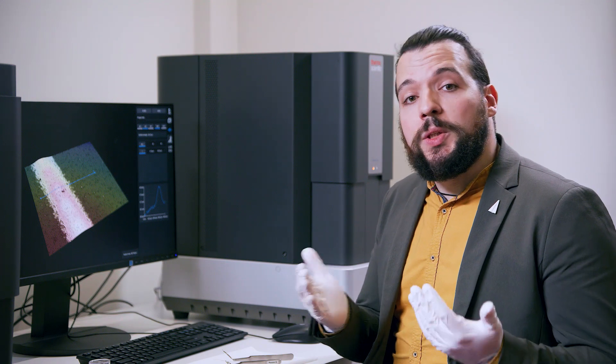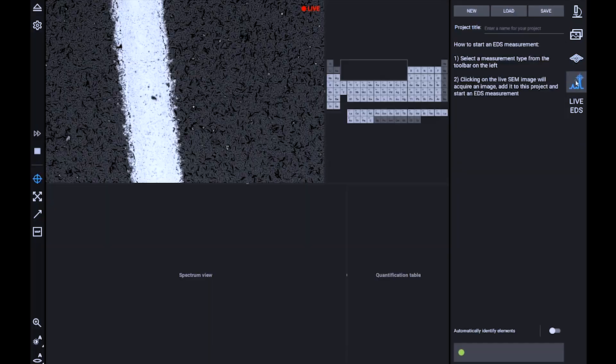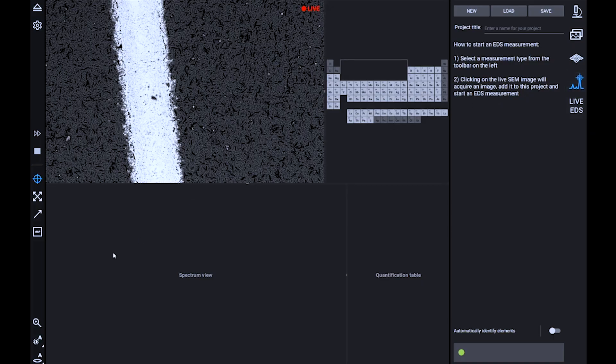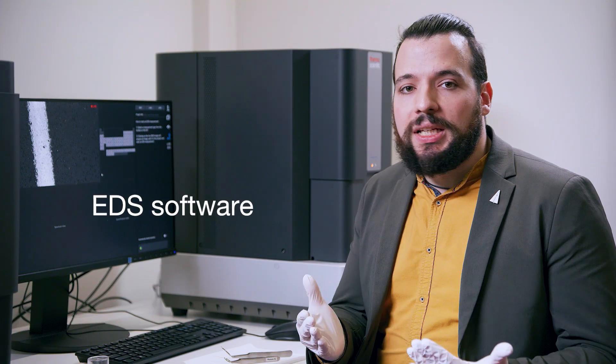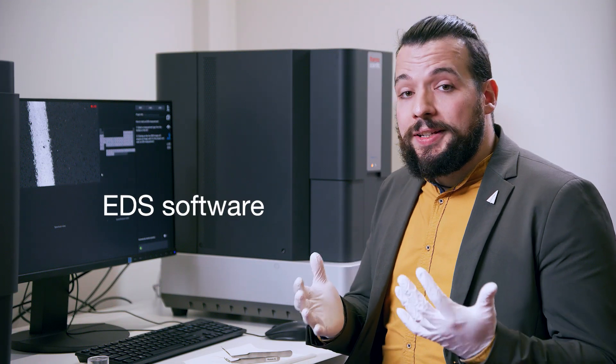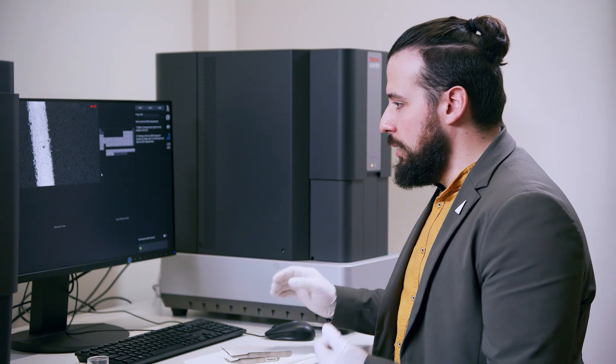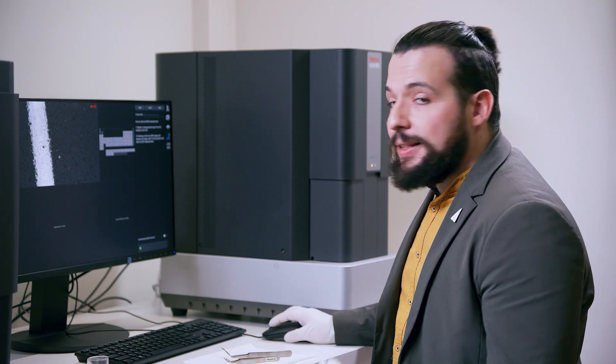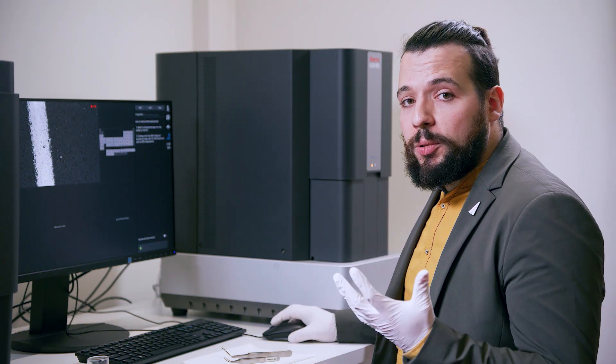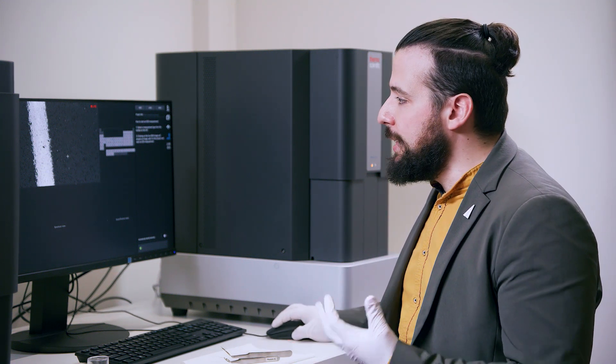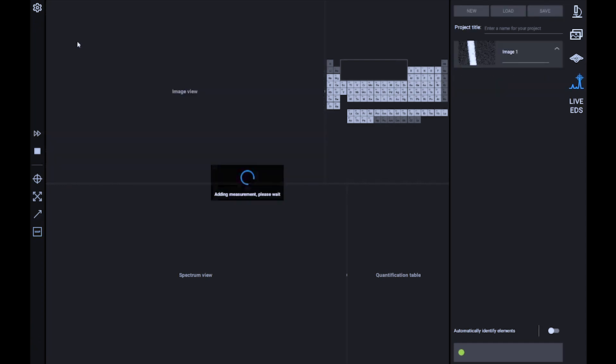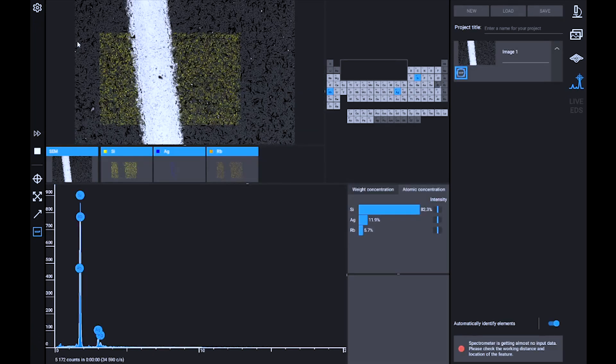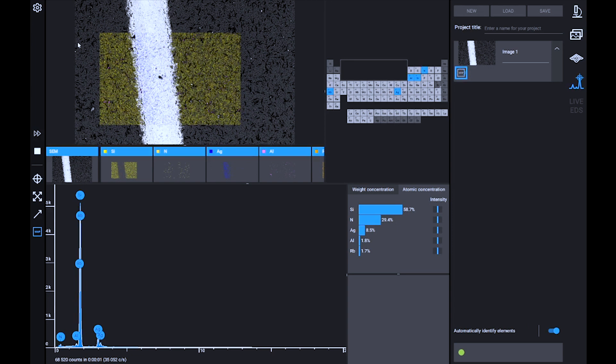We can quickly switch between software on the right part of the screen. Within the EDS software, we have access to different scanning possibilities, for example, the fast EDS mapping. By clicking this option and selecting the portion of the sample that we want to analyze, we immediately get a distribution of colors that highlight the presence of a specific element in different parts of the sample.